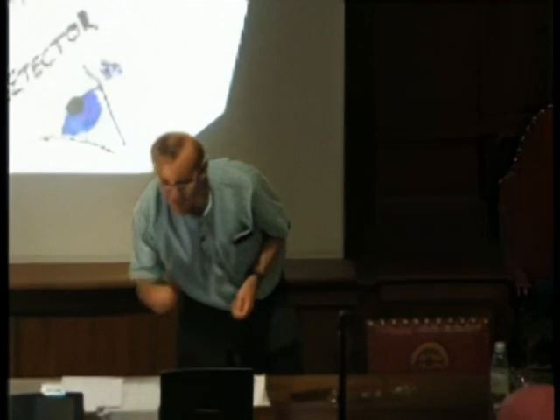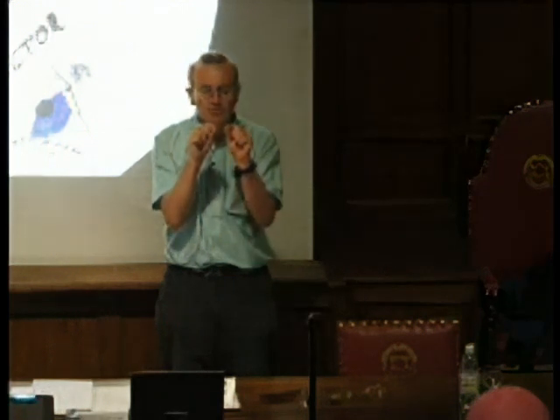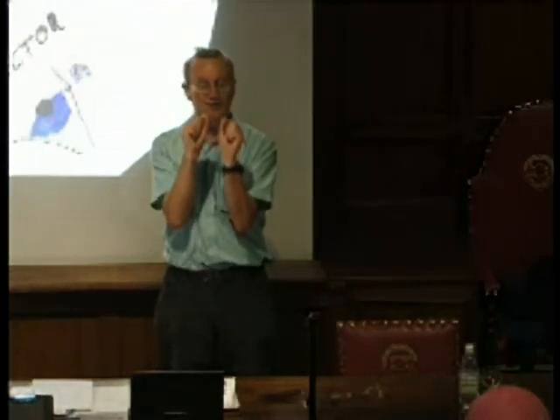So suppose that you want to go and look at the atoms that that person is made of. How do you do it? I mean, can you get a magnifying glass and go and look very, very closely? The answer is no, not if you're using radiation that our eye picks up, because a magnifying glass makes things bigger. But what we're trying to do is to be able to resolve things that are very small, to be able to look with such precision that we can separate one small distance from the next. And the problem is that you're limited with ordinary light, just like a wave. Well, let's look at the next picture to give an illustration.